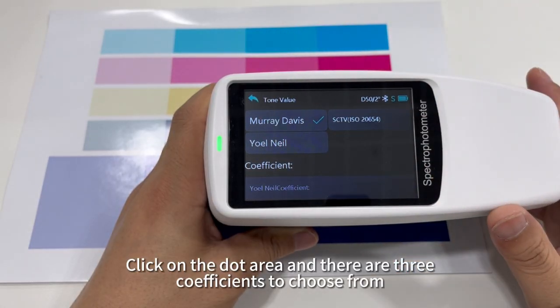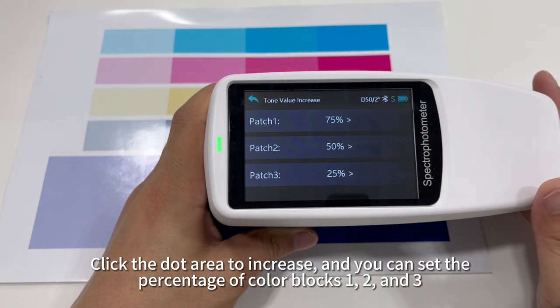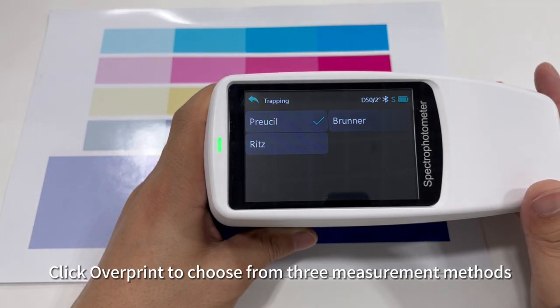Click on the dot area and there are 3 coefficients to choose from. Click the dot area increase and you can set the percentage of color blocks 1, 2 and 3. Click Overprint to choose from 3 measurement methods.